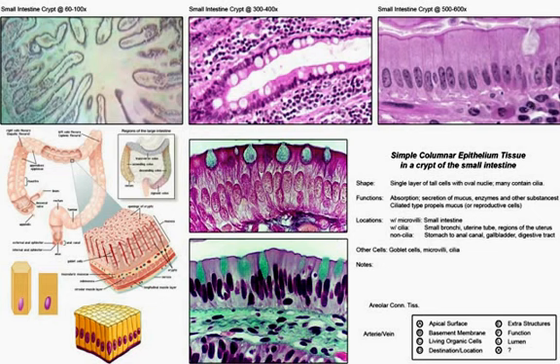For example, this would be a cuboidal lined submucosal duct of a gland. And then we would have a number of different types of cells throughout the areolar tissue that it's bound to. You can see different numbers of goblet cells associated on those apical surfaces producing mucus to decrease surface tension as you move through the digestive tract and the tubing that's carrying the waste.